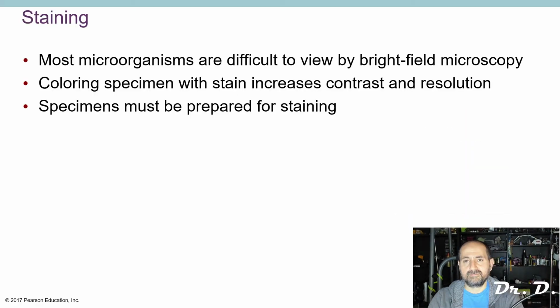In this video we are going to be finishing up Chapter 4 of our Bauman textbook, talking about staining and classification of these microorganisms. With staining, remember the point of staining in microbiology is to increase contrast. If you're looking at E. coli under the microscope and you haven't stained them, they're going to be very difficult to spot because they're clear, colorless. So we use staining procedures which introduce dyes, and these dyes stick to the E. coli, and therefore you can see the colorful E. coli.